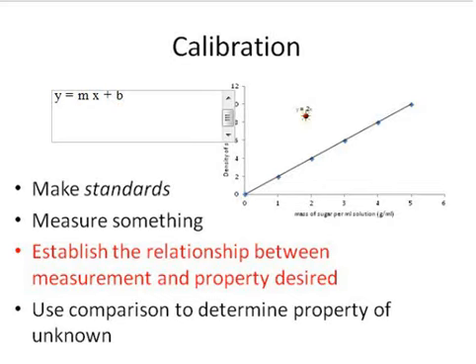M in any case should be a number, and it probably won't be 2. So you probably will get some value of m and some value of b when you ask for this equation to show up on the chart. This equation clearly is pretty small. It says y equals 2x, but it may be difficult to see on your monitor. Typically, you'd want to make that big enough that the TA who's grading a report can actually see it.